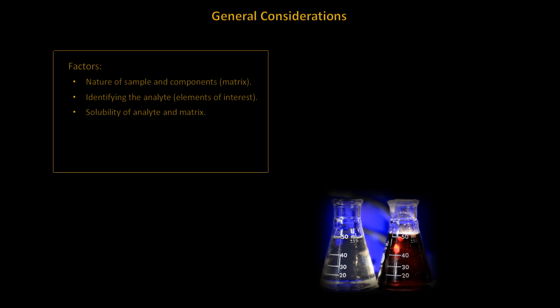By determining the aforementioned, you can determine the type of analysis that you may require, such as titration, which will be discussed later in this series, or instrumental. You will also need to determine if there will be any sample loss due to volatilization, etc.